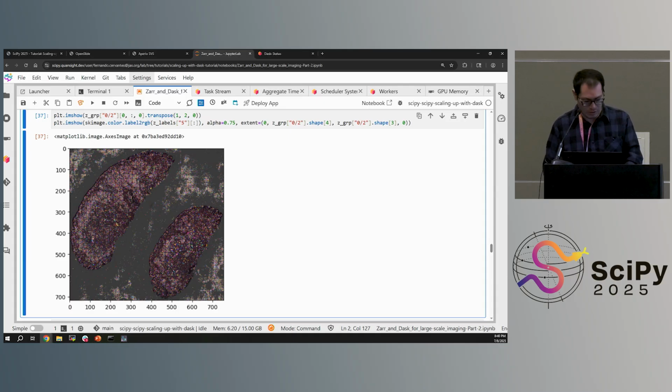So if you run this and you inspect what is generating, you can see that it is still not computing the full segmentation, but we now have a Dask array that can compute the Cellpose inference on the whole image. So I'm going to show here that we can compute that on a region of the image. So plt.imshow DA labels, and I know that there is something in these coordinates, 8,000 plus 512 and 2,000 plus 512.